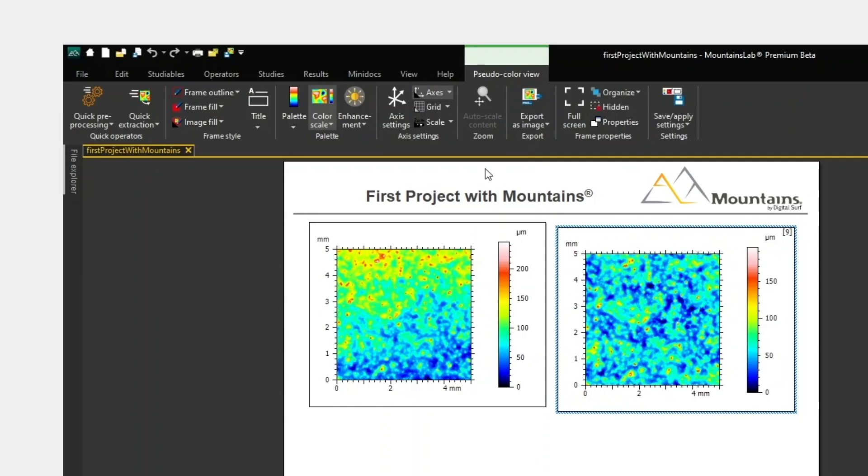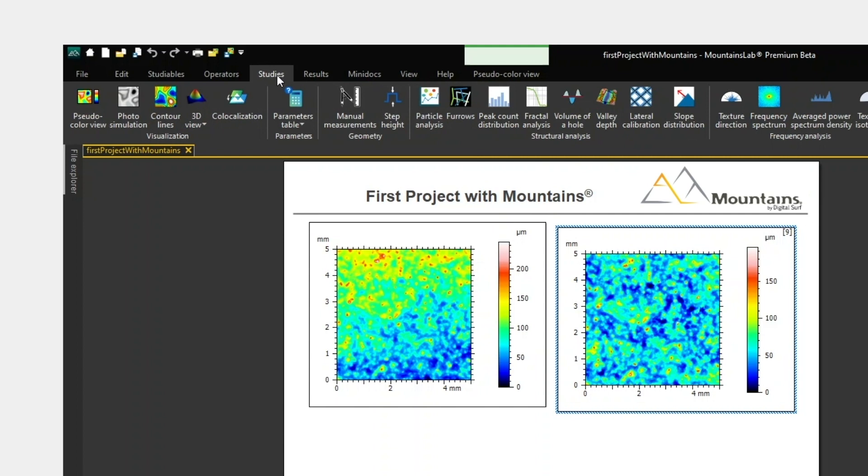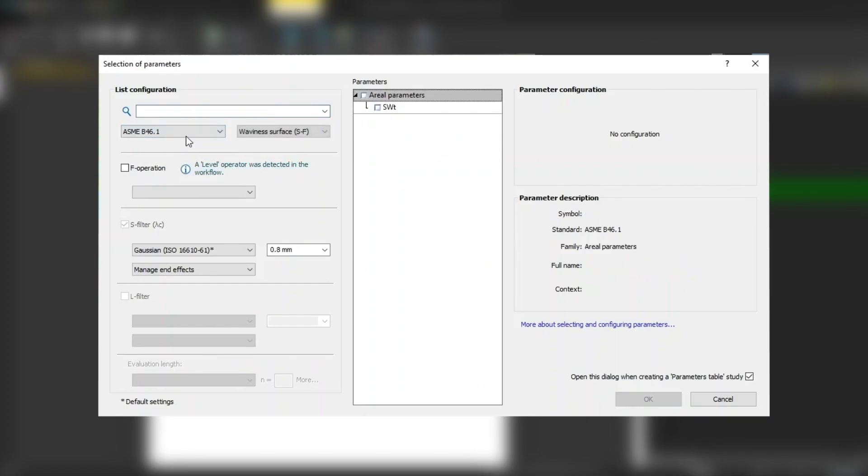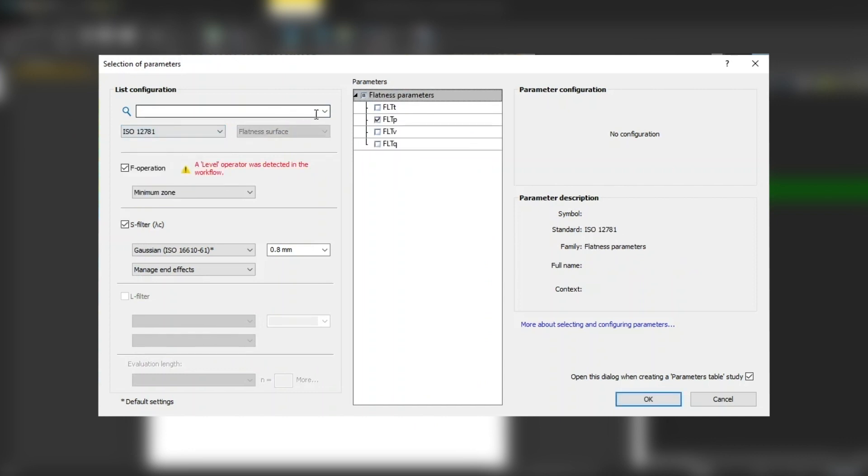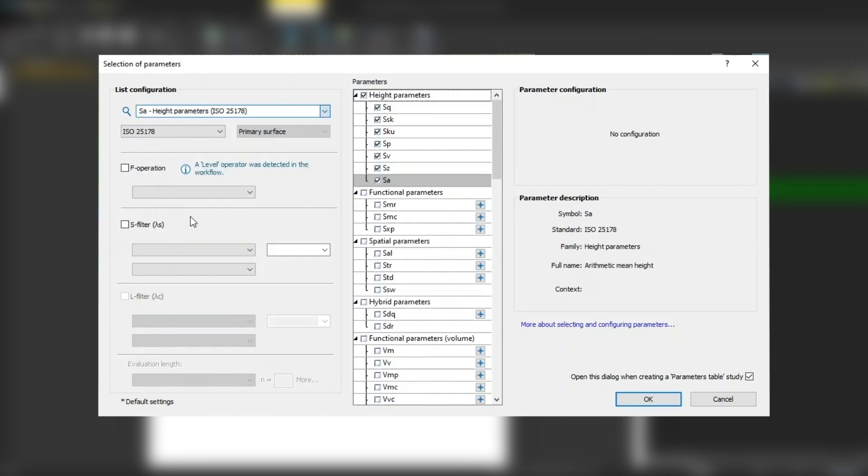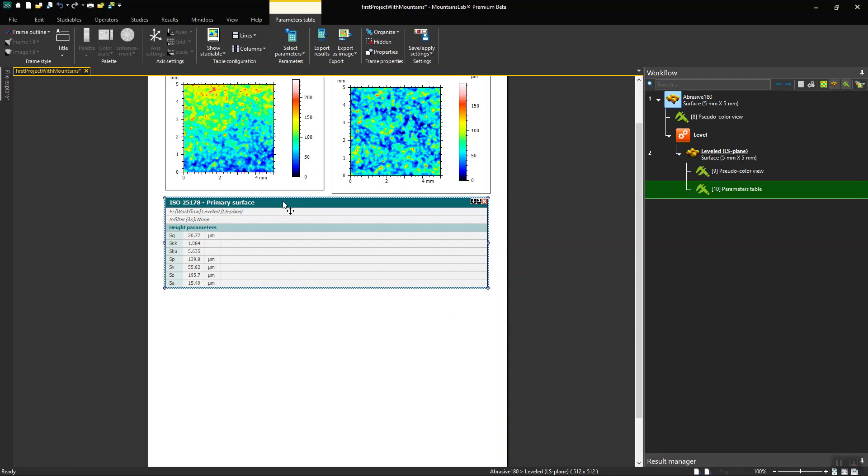Now I'm going to go to the Studies tab to generate a table of parameters corresponding to my corrected studyable. I choose the Parameters table study, which I configure according to my desired settings. The Parameters table is then generated in the document.